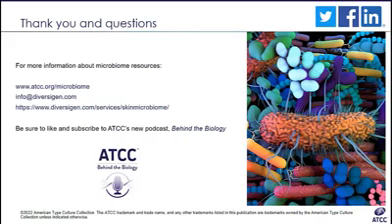Also, I wanted to add that even if the study that you're using right now uses pipelines that have been benchmarked before using a standard like a mock community, I think the use of standards needs to continue somehow, because there are other biases that we usually forget or do not think about, like changing the technician from day to day, a new batch of reagents, problems during transport or shipping of the samples to the lab. All these things can affect your results. So it's very important to add these controls, even if your pipeline has been benchmarked.